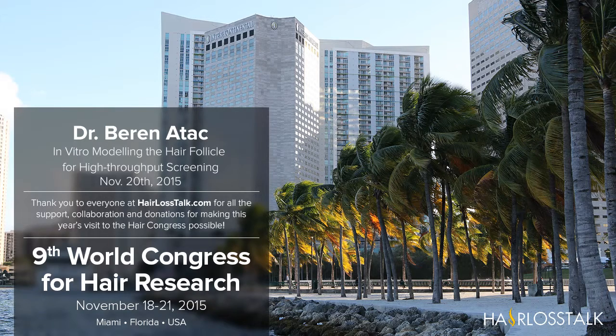So the imaging was a big challenge, and thanks to the Max Planck Institute, we got really good help. And even though the imaging takes around 18 hours, they were able to manage the data. So we didn't see any necrotic structures, and we could also see the melanin particles transferred.